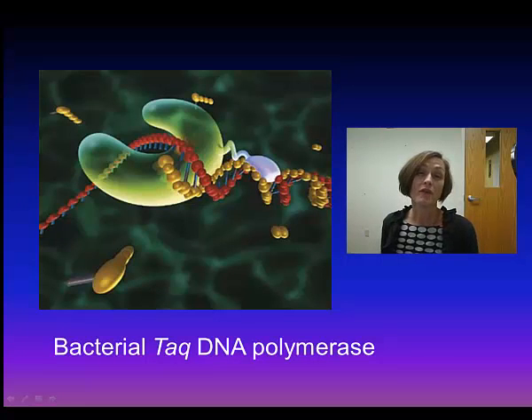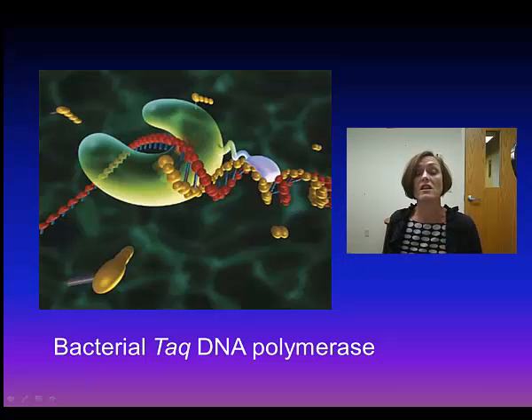There really isn't any way to overestimate the impact that PCR has had on molecular biology, forensics, and several other fields as well. The ability to take a little tiny piece of DNA, one strand, and get to 1 million copies in a 3-hour cycle removed the need to generate large amounts of samples to work with. Previously, people had to really be able to collect blood samples or a tissue sample that was rich in nuclei. And if you wanted to work on something like a flea or lice or anything small like that, you were basically out of luck if you wanted to look at DNA in a single organism, because DNA had to be pulled together in order to get enough to work with.